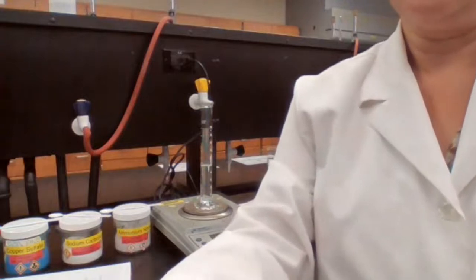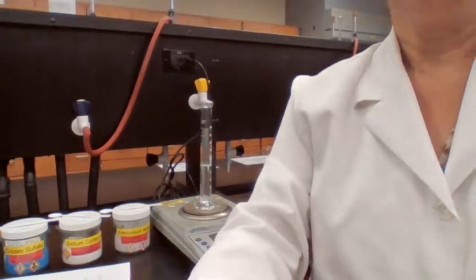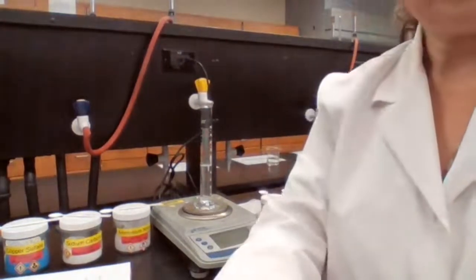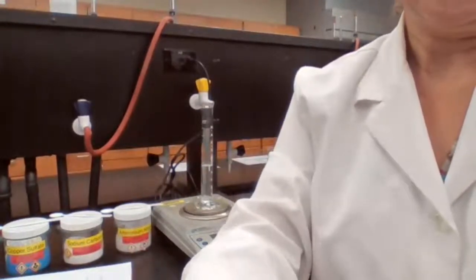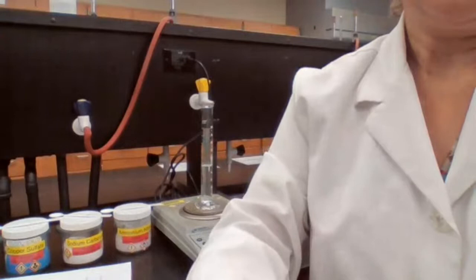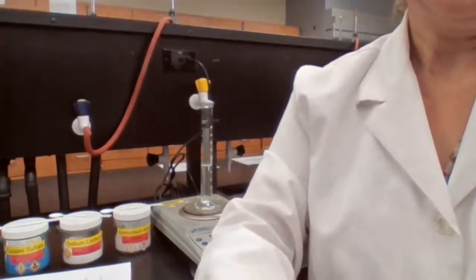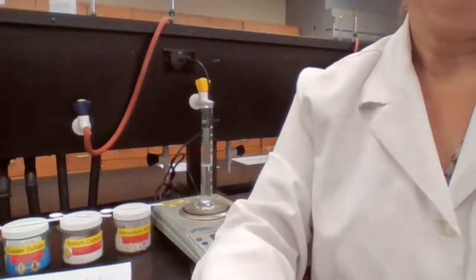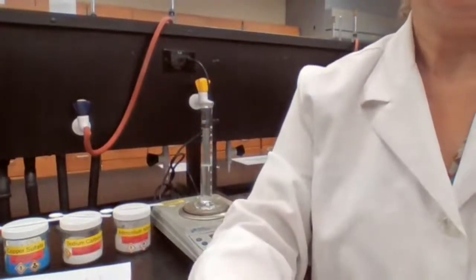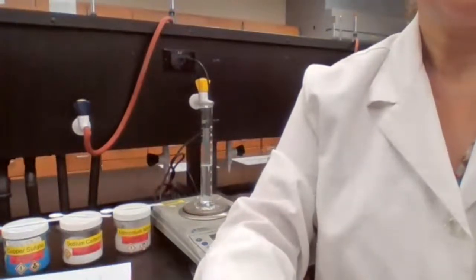That number now is 168.290 gram. It's the mass of graduated cylinder plus 50 milliliter water.